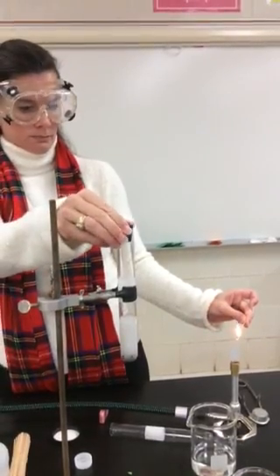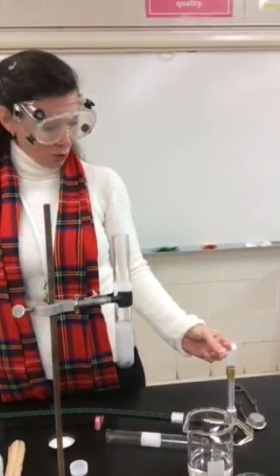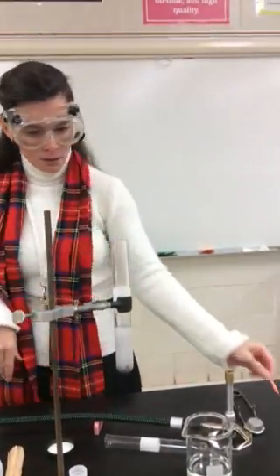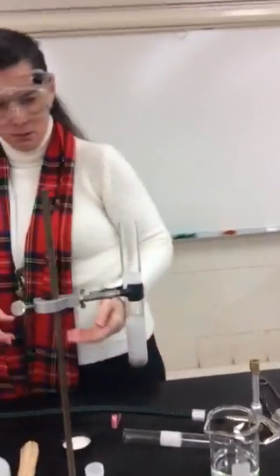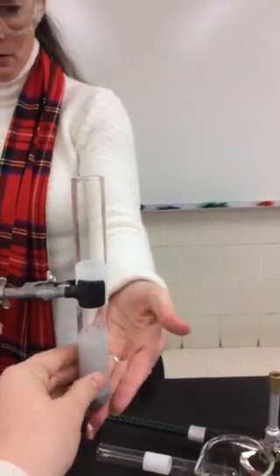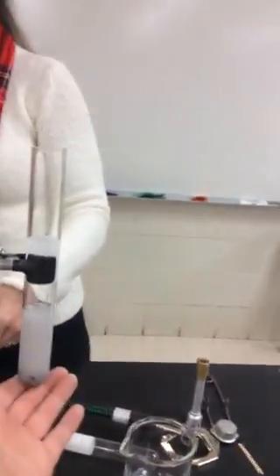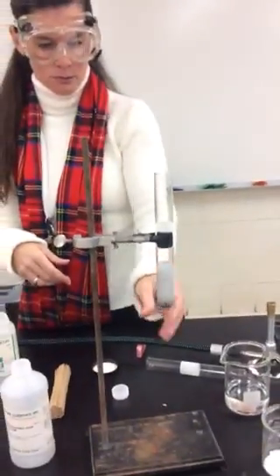So here we go. Make sure that you record that that was hydrogen gas being given off. And Abby, I want you to feel the test tube. Is it warm? Cold. Feel the bottom. It's warm. Yeah, it's a little bit warmer than room temperature.